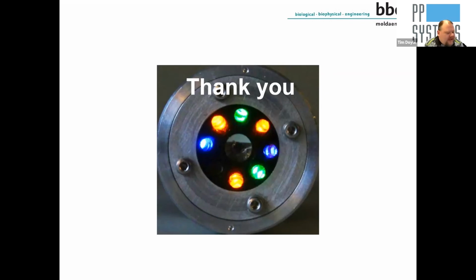Is there any reason to suspect differences in fluorescence from cultures versus natural phytoplankton communities found in natural waters? Indeed, as I told you in the beginning, from the history, when we started up with a library or a collection of many different algae, we cultured them in our laboratory and used them to find out if this works. So when we started up, we had a lot of different algae. And then we used this also to compare this with algae in the field.